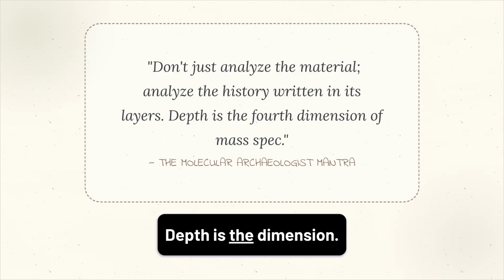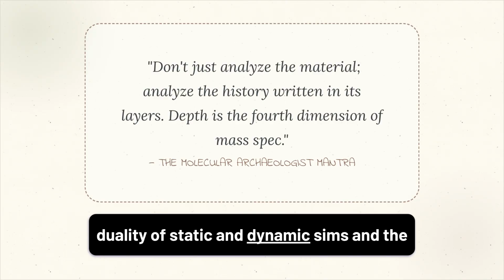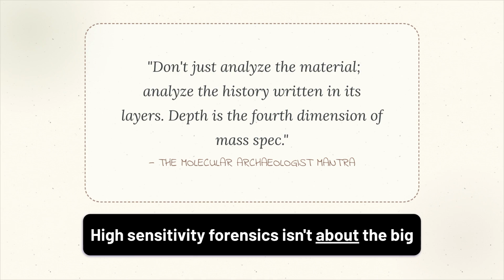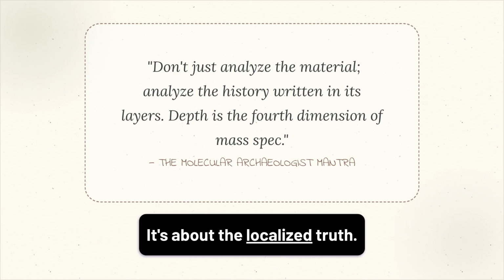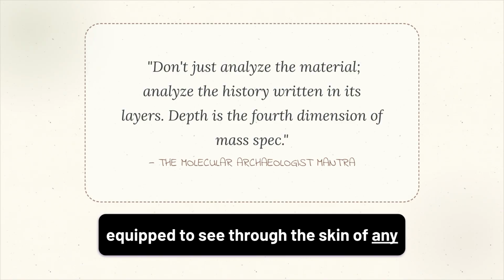Summary. Depth is the dimension. We've mastered the collision cascade, the duality of static and dynamic SIMS, and the power of 3D mapping. High-sensitivity forensics isn't about the big picture. It's about the localized truth. You are now a molecular archaeologist, equipped to see through the skin of any material.